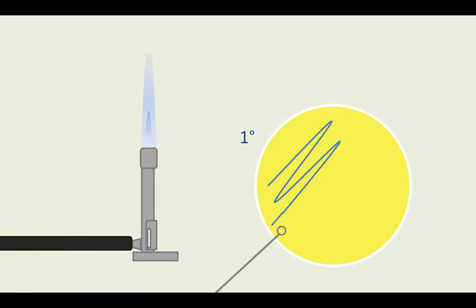To make the secondary streak, cross back over the end of the primary streak once or twice, so that you draw some of the bacteria from the primary streak onto a new part of the plate. You are effectively diluting the bacteria on the surface of the plate.